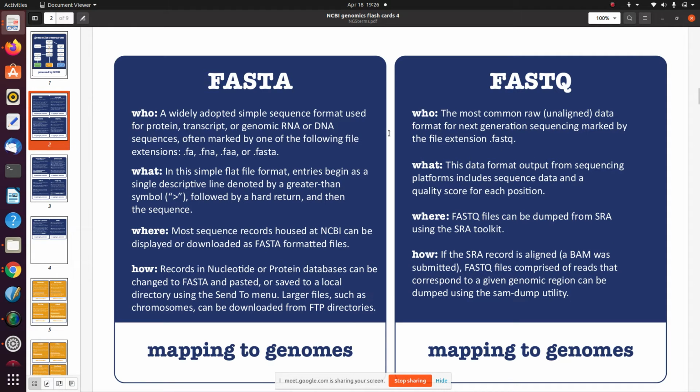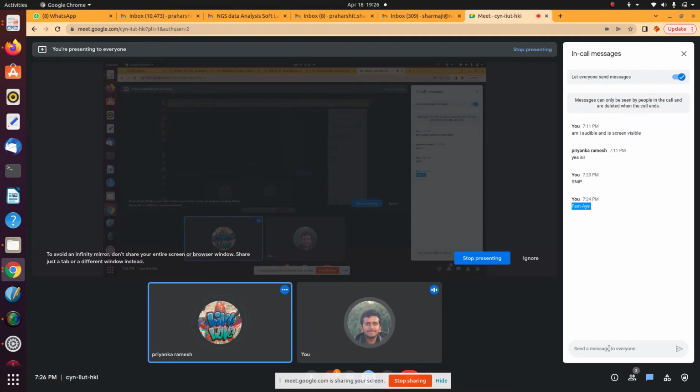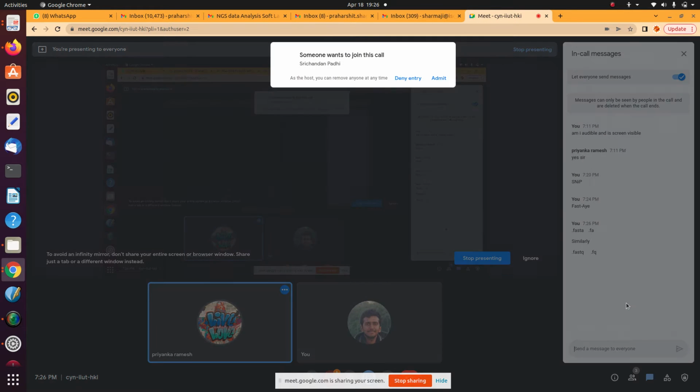So just like FASTA can be represented in .fa, right? Yes. FASTQ can also be represented in .fastq, .fq. Okay.